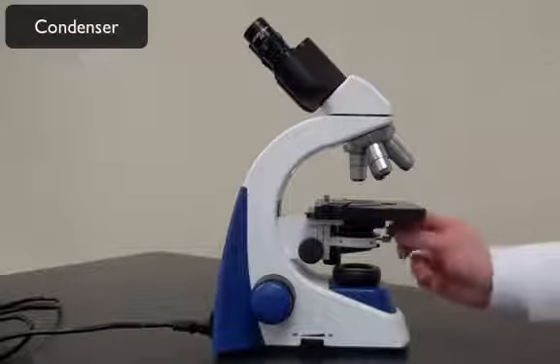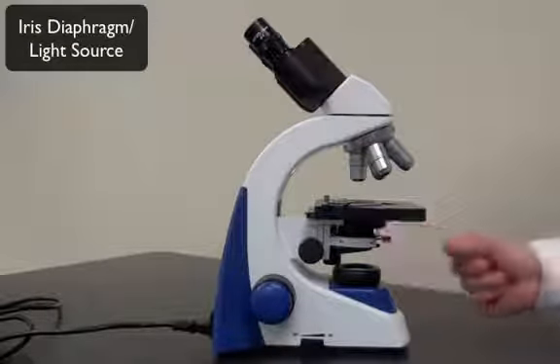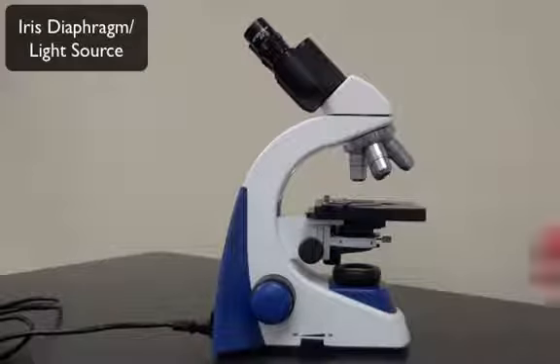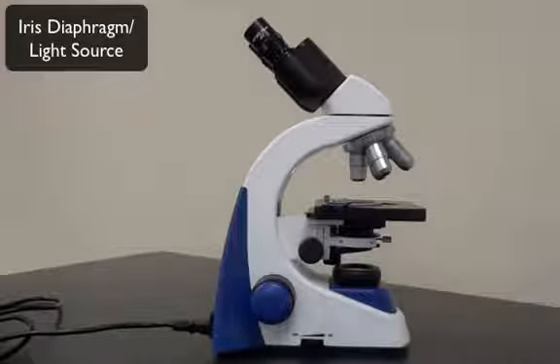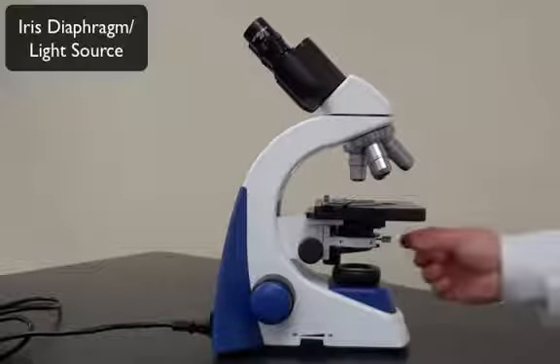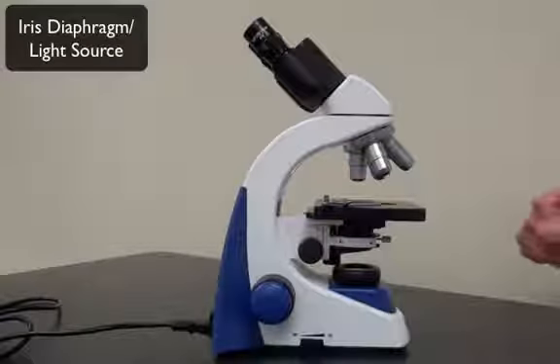But underneath the condenser, right here is this little lever, and it's called the iris. It basically is a filter for the light coming up from the light source, which is right here. Here's our light source right there. With the iris, you'll see the changes that the iris can produce in the amount of light being directed onto the slide. So that's one way we can focus the light, along with the light source here, which we'll get to in a second.